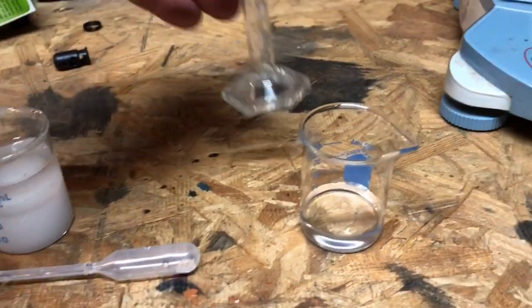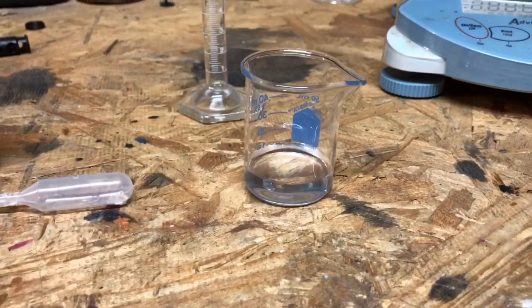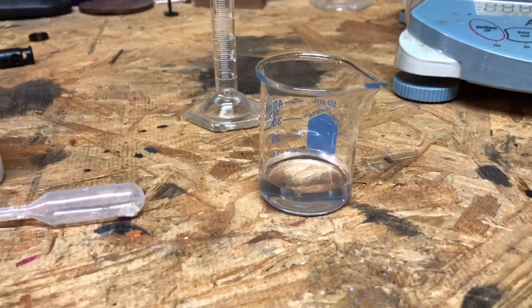Okay. So we've transferred the solution to the beaker, and now what I'm going to do is heat this up. And what is going to happen when I heat this up?